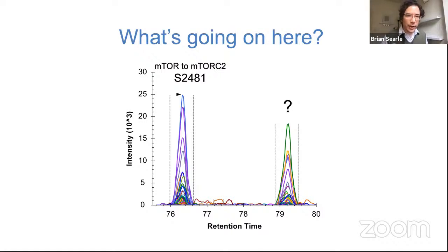What's going on in this case is I'm looking at a phosphopeptide experiment where a phosphate is being moved from one position to another on the same peptide sequence, just with different localizations. Because there are different localizations, the retention time shifts considerably, and the relative abundance of the different fragment ions is a little bit different. Well, you get 2 different sets of measurements.